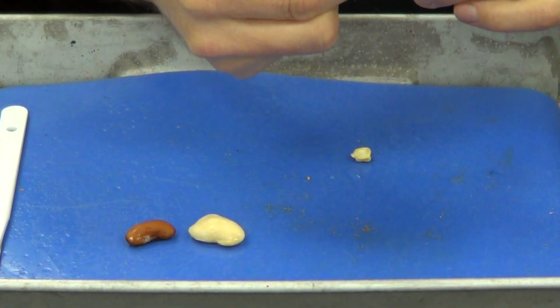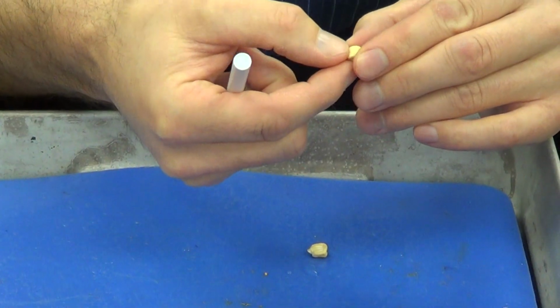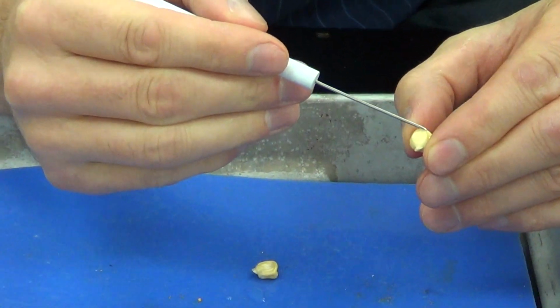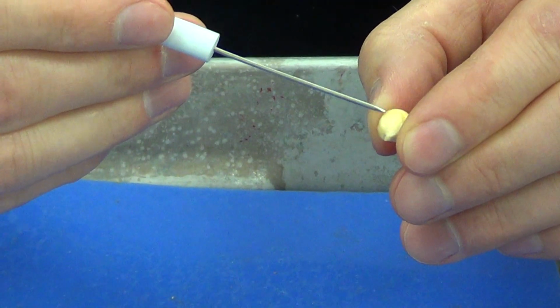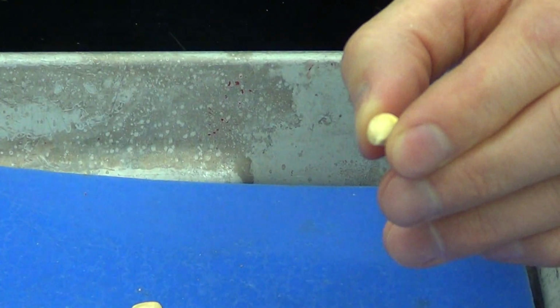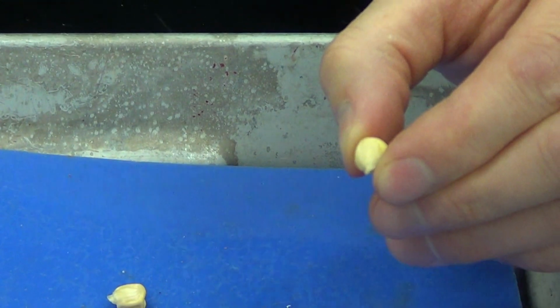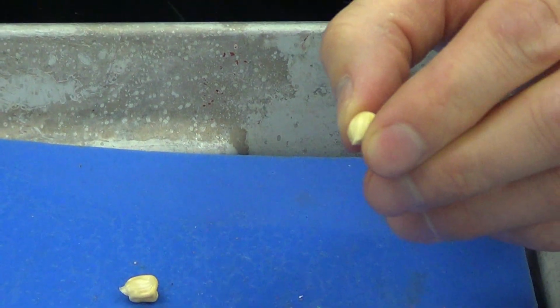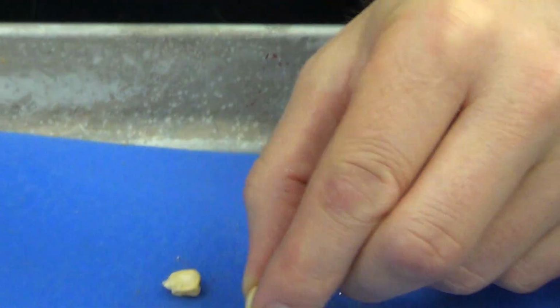What I'm going to do is look over the outside of the corn seed, and I'm going to look for this white sort of apron-like structure. You can see it right here. This is going to be the embryo, and we want to look for that, because if we cut the seed in the wrong plane, we're not going to see the structures that we need to see. So let's go ahead, we're going to cut this white apron-like structure right here.